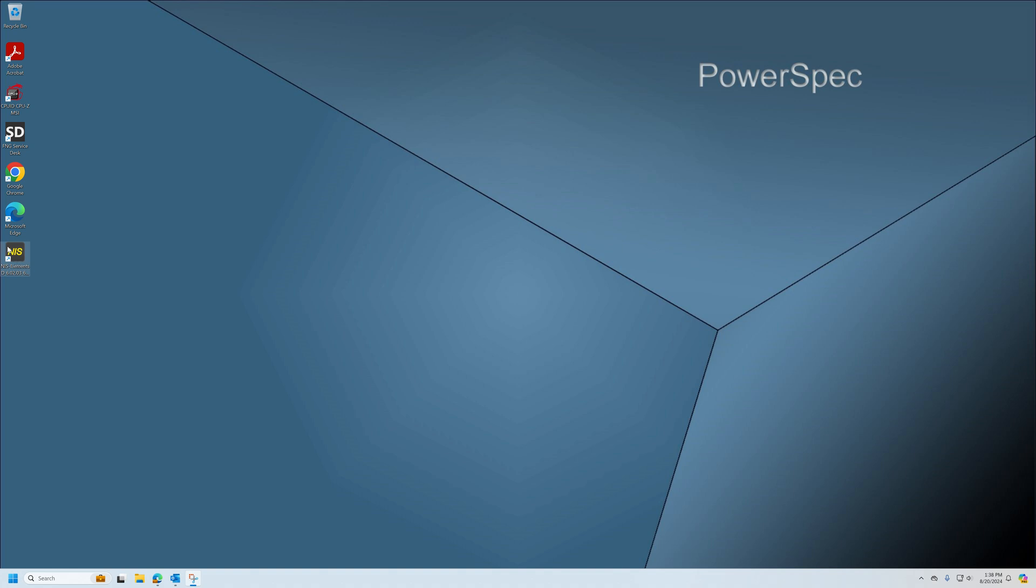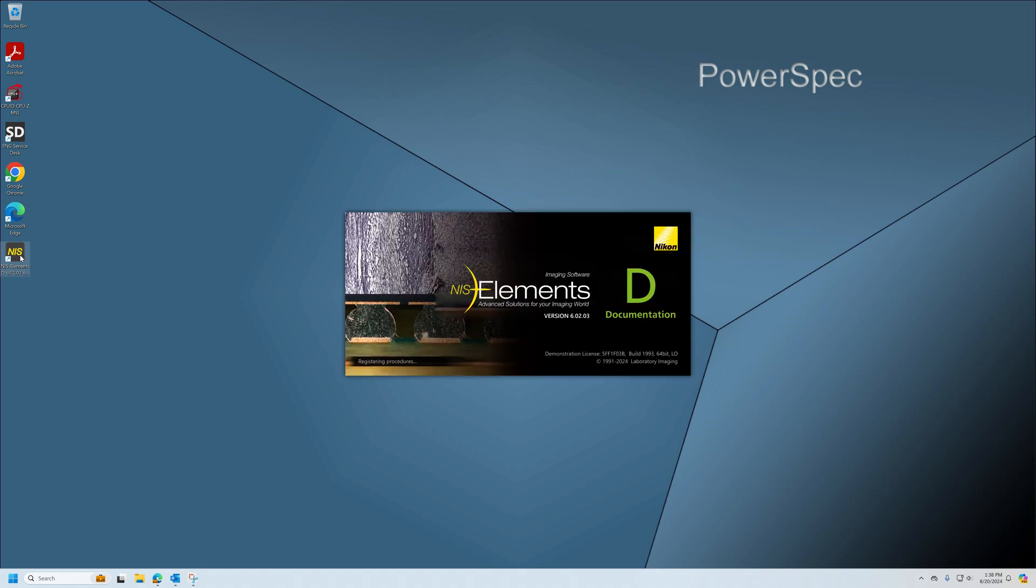Place your cursor over the desktop icon and double left click, and then the software will open.